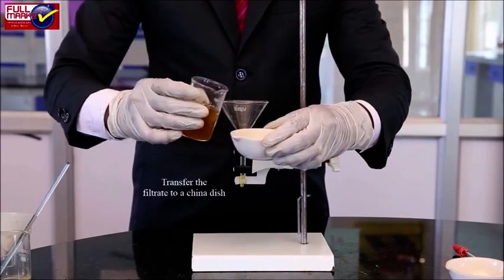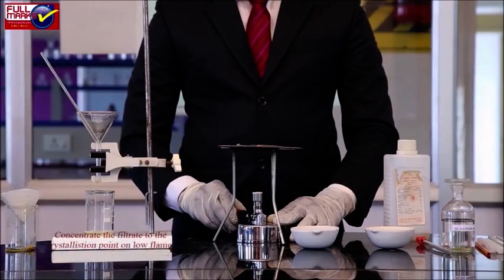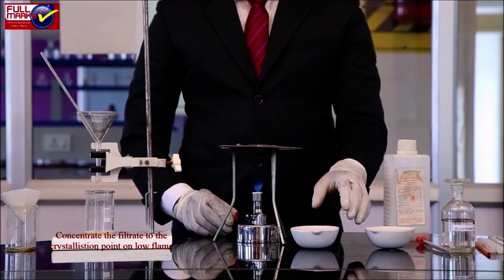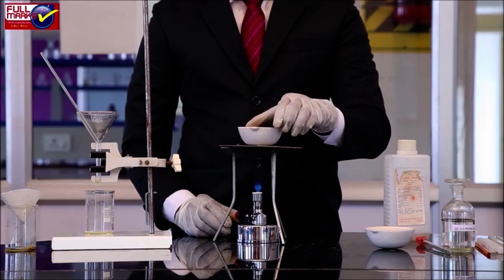Transfer the filtrate to a china dish. Concentrate the filtrate to the crystallization point on a low flame over a wire gauze kept on the tripod stand.